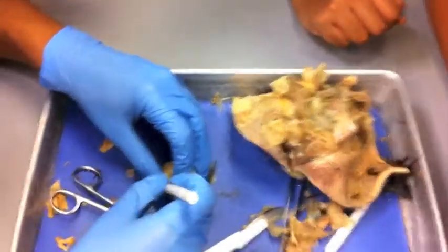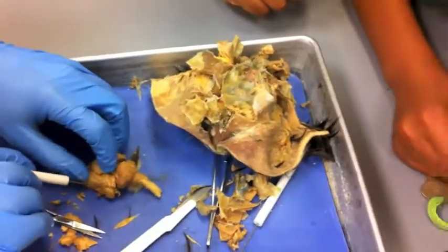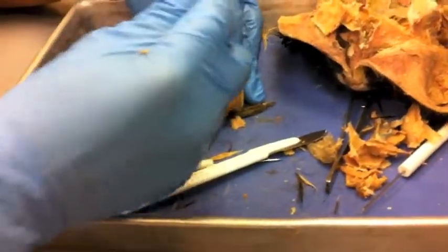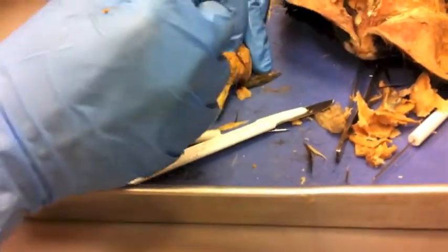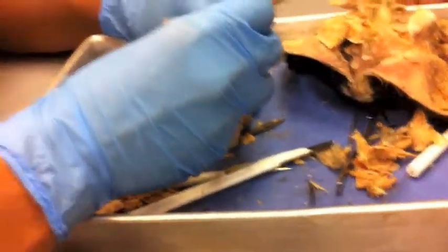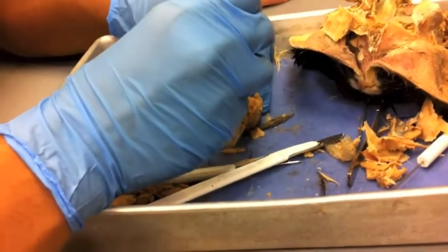A picture of the cat. I'm just looking from that iPhone. I can see the iPhone. Therefore, I see the brain. Ow. I still don't see the brain. I guess half of us don't even need the camera. We're gonna memorize it. Remember this forever. Yeah. It's okay. I got a video of part of the lecture. Dentate gyrus. So cool.